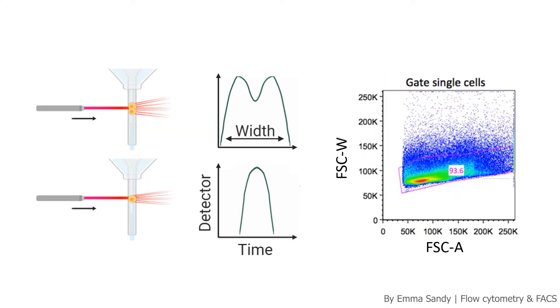After gating for cells, we want to do doublet discrimination, meaning we're only going to forward single cells in our analysis. To do this we change the y-axis to forward scatter width, which allows us to circle only the cells down here that are going to be single cells, and we exclude the doublets — that population straying up to the top.